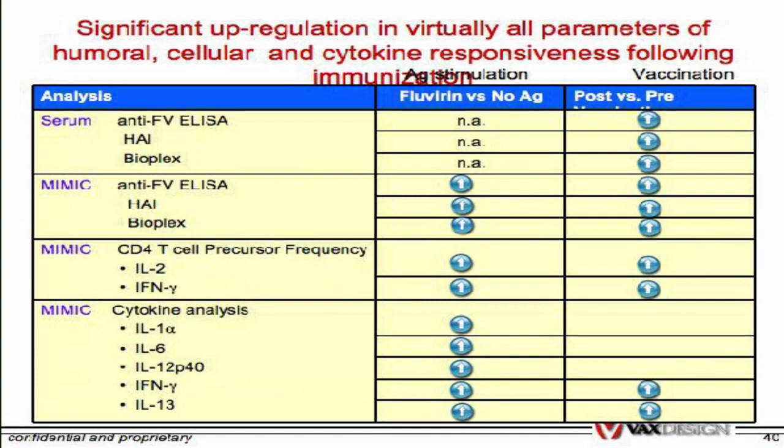This happened to be for a flu study that we did with the CDC recently, where we were looking at the 2006-2007 influenza vaccine, and we actually found some very interesting results as to why that vaccine was not as good as they had hoped it would be.